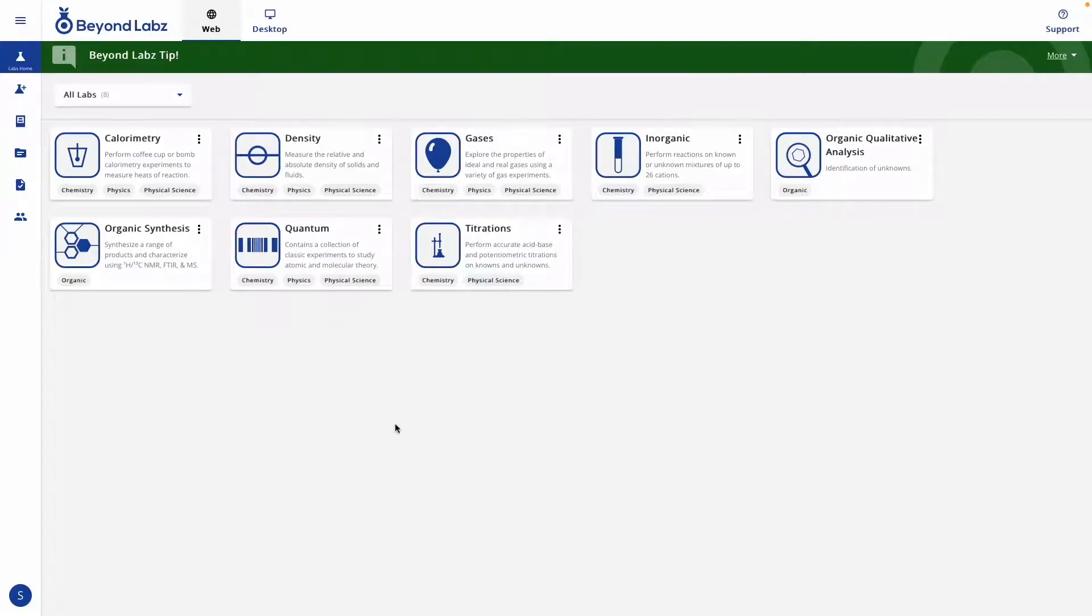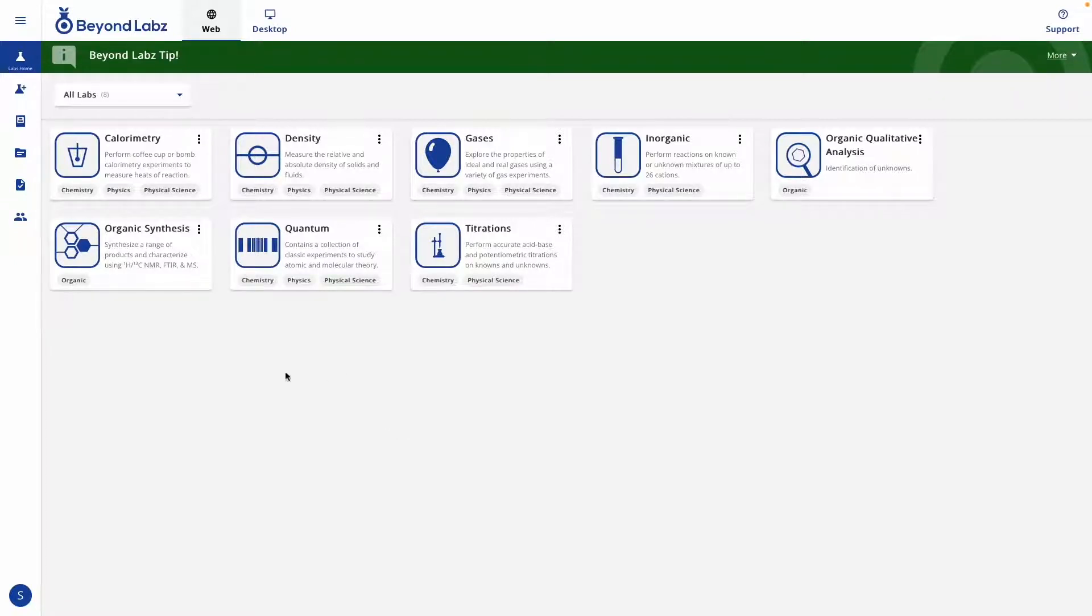Welcome to BeyondLabs version 3. If you're reviewing this video, that means you have a student account, and this is just a brief overview of the student view for BeyondLabs.